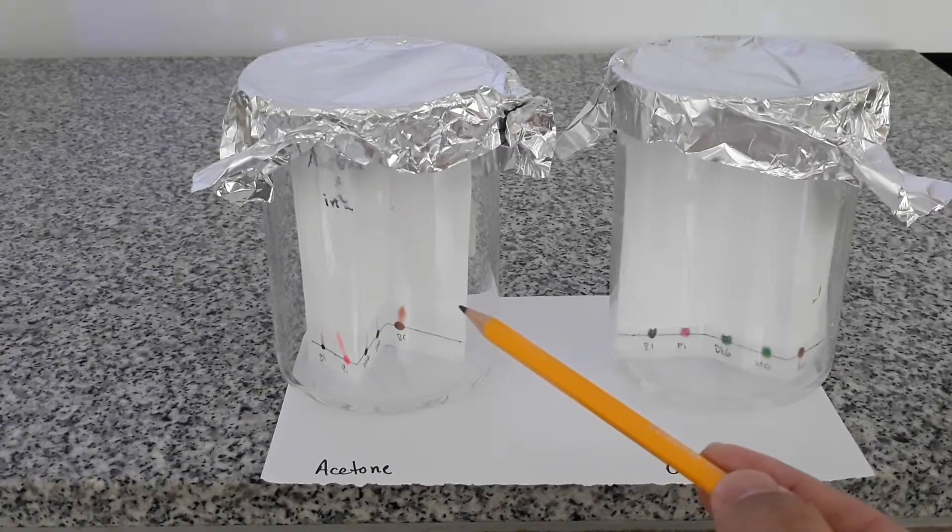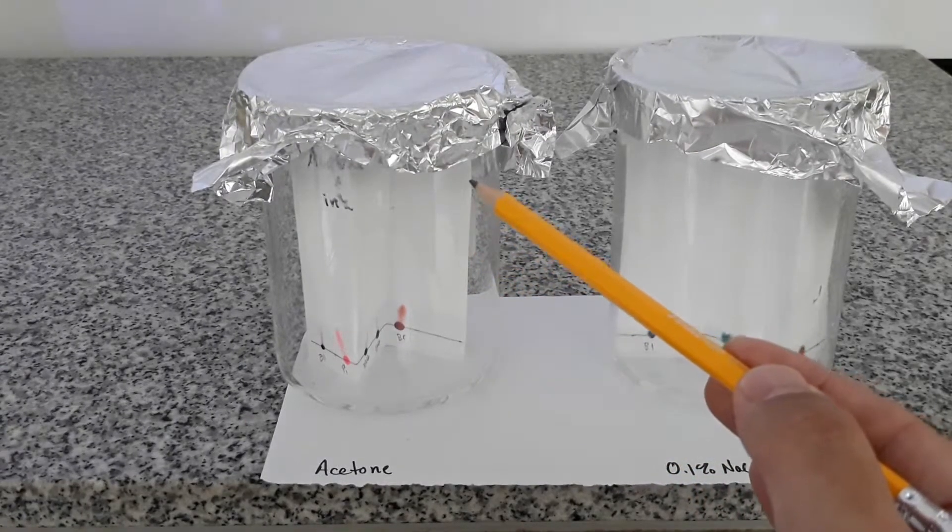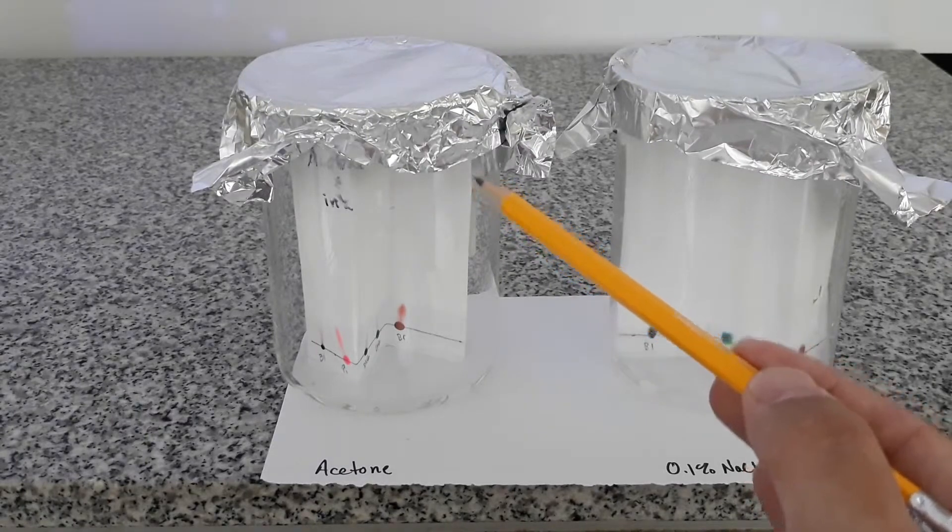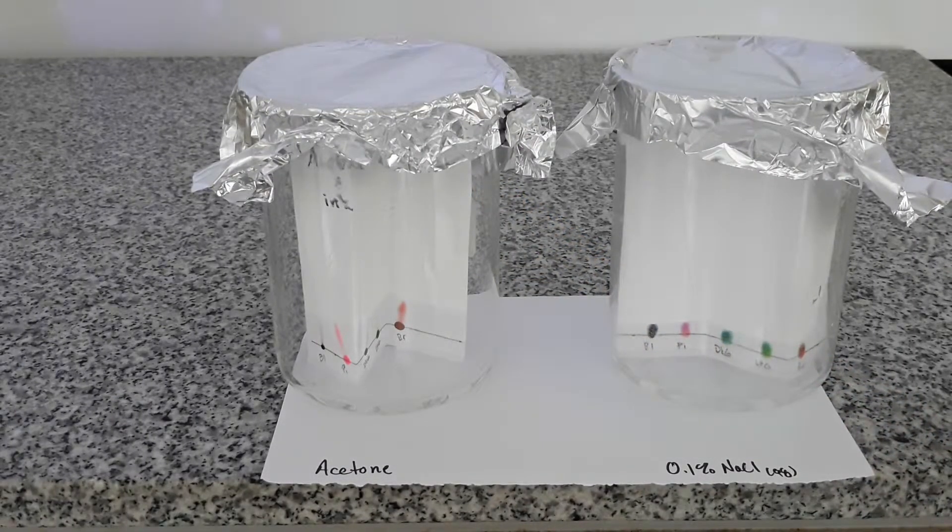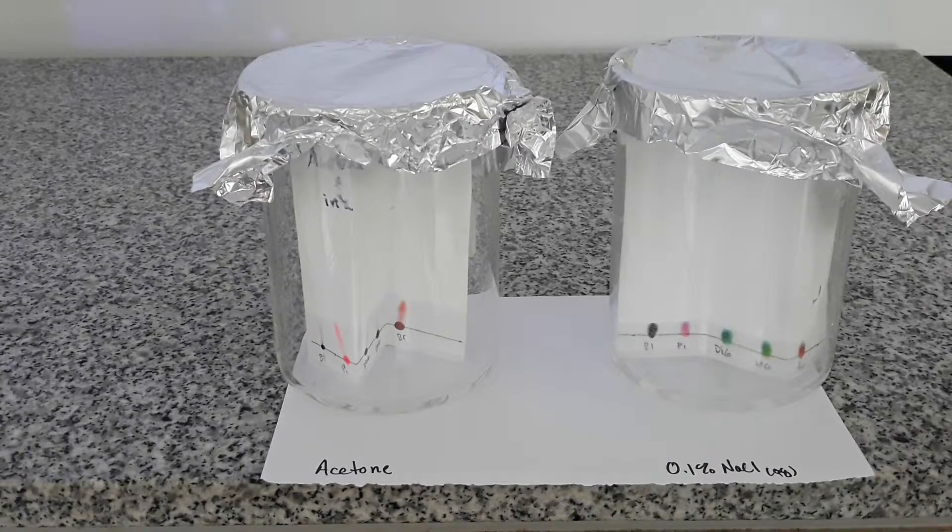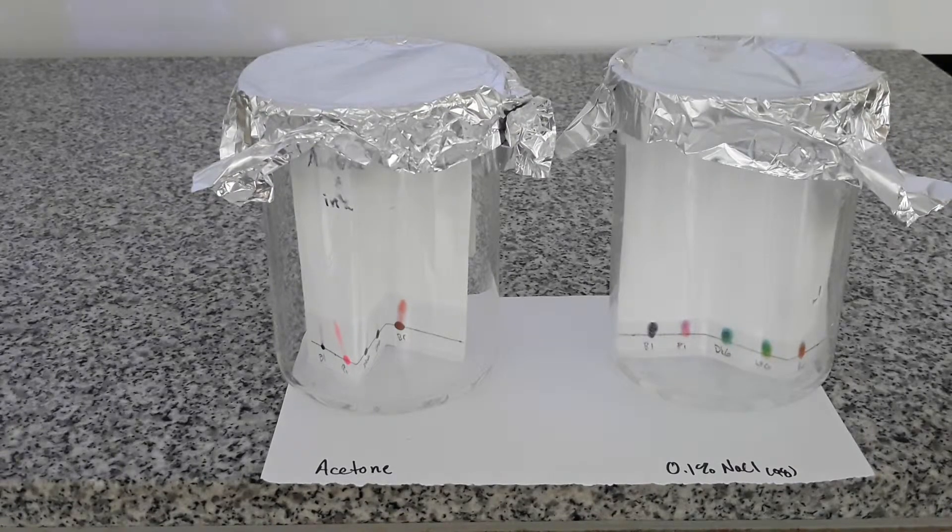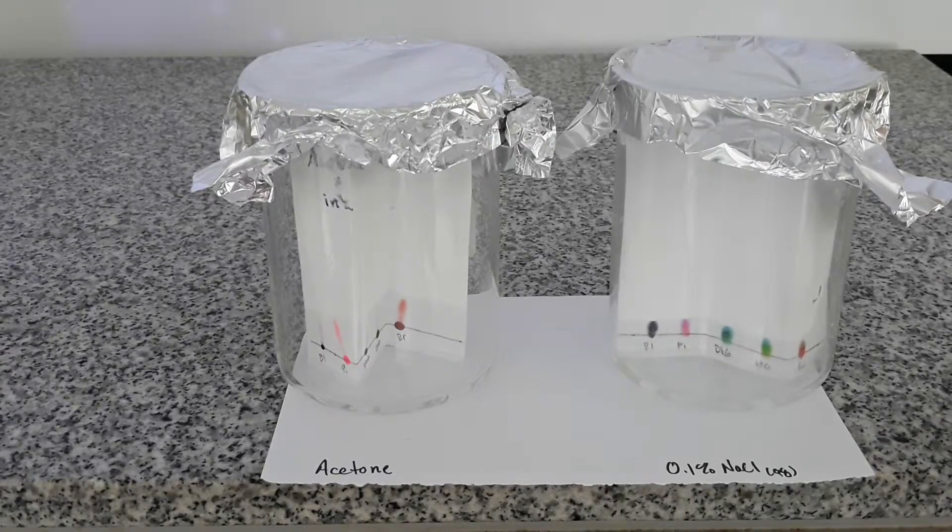So you can see the solvent front travel up the page and when it gets about two to three centimeters from the top is when you want to stop it. You do not want to let your mobile phase run off the end of your stationary phase or it becomes impossible to get correct measurements.